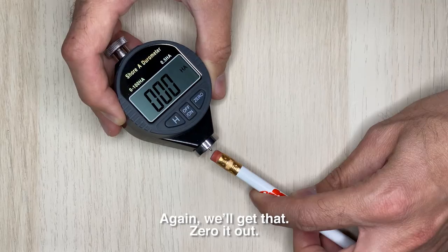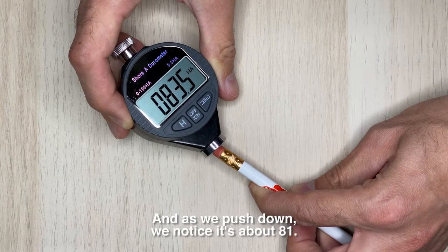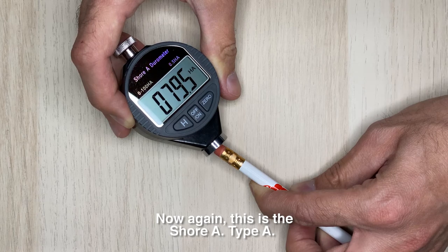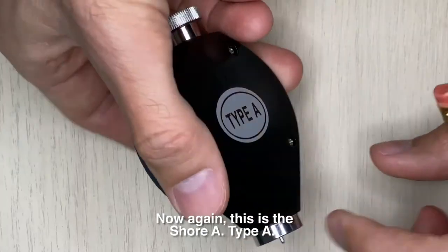We'll zero it out, and as we push down we can see that it's about 81. Again, this is the Shore A type A scale.